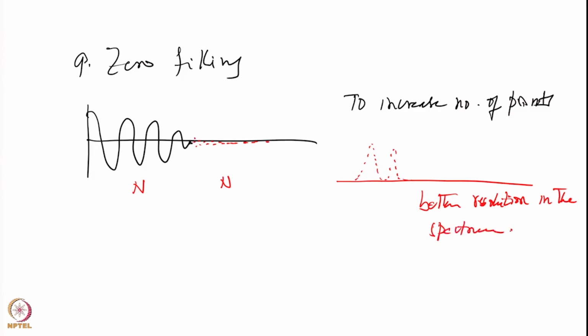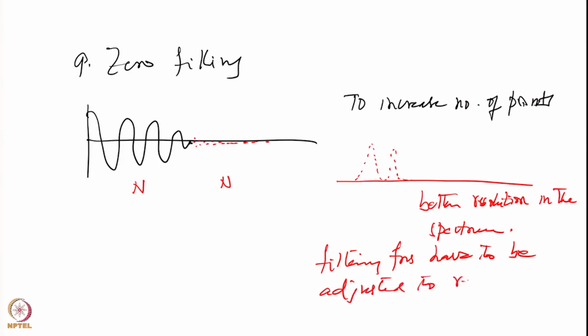And of course, when we do this, the filtering functions have to be adjusted to remove the wiggles. Okay, so I think we will stop here and continue with the next class.